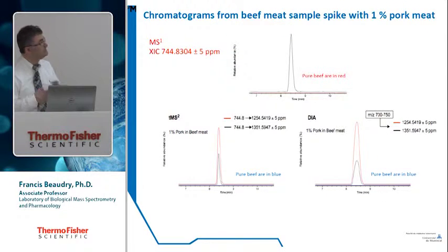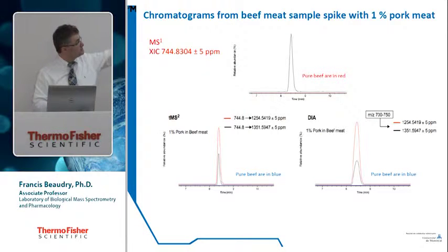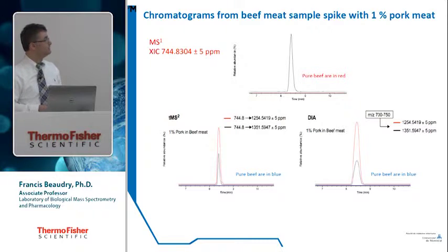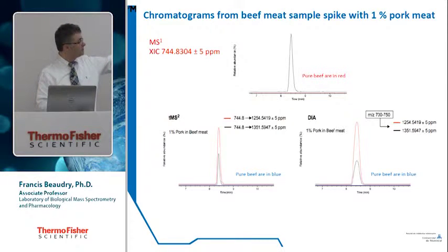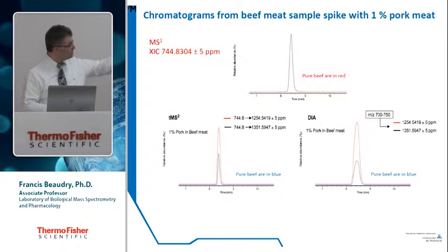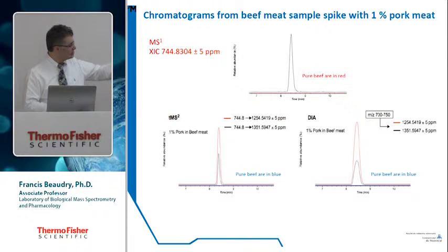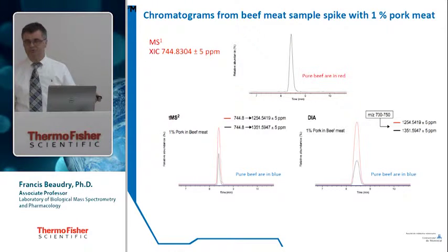When we look at this in detail, because we want to see the chromatograms, we want to prove that it's really there. When we look at the beef samples that have been spiked with 1% pork meat, we can see the nice myoglobin peaks, very nice at 1%, and you can see it's clean with beef that is not fortified. And when we look at the targeted MS2 data, we overlay both extracted ion chromatograms from both fragments, and you can see, first of all, the ratio that respects the MS spectra, but also very nice and sharp peaks. We don't see it very well, but downward you can see pure beef in blue and there's absolutely no trace, no interferences.